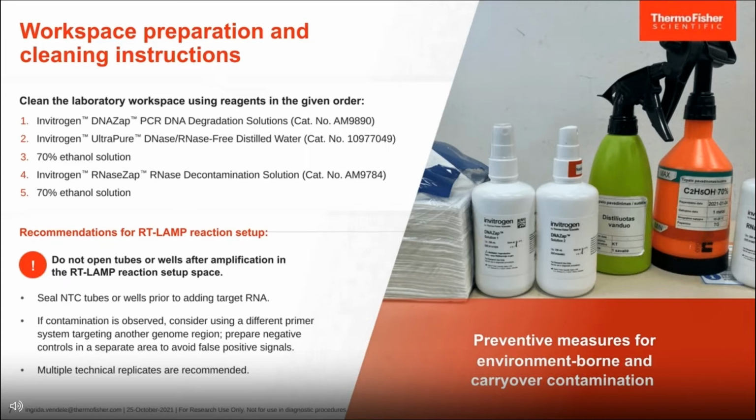However, the most important recommendation is really to not open tubes or wells after LAMP amplification in the reaction setup space to prevent amplicons spreading on the workspaces and contaminating, causing a false positive signal in your new reactions. Also seal your no template control tubes or wells prior to adding a target RNA or DNA.